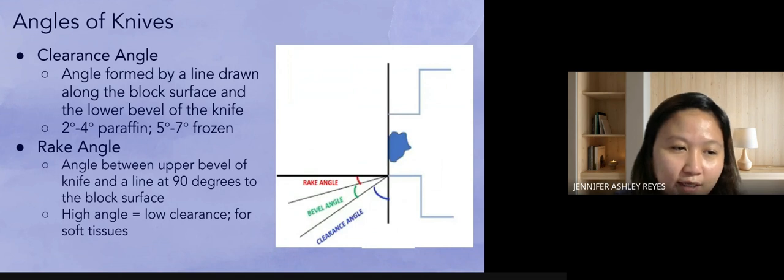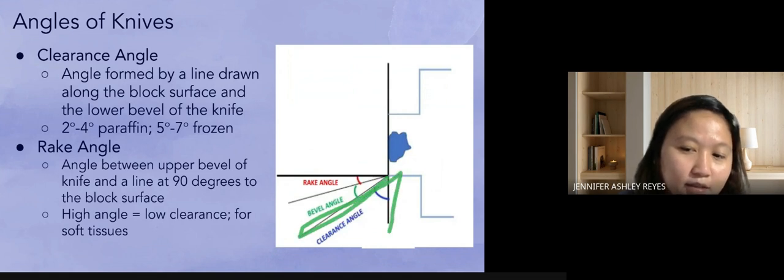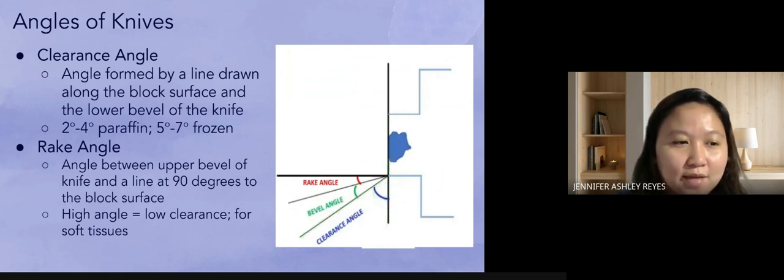So the clearance angle is the actual angle between the lower bevel of the knife and the block surface. Lower bevel and the block surface. So that's clearance angle.